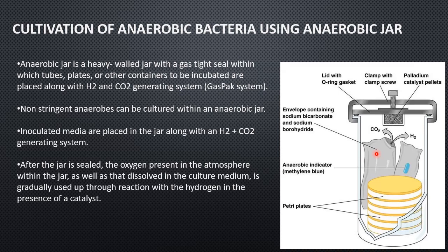When the reaction starts, the combination of the chemicals will start evolution of CO2 and H2. The H2 will now react with the palladium catalyst where the oxygen is present and it will start generating water. So again the same principle of palladium catalyst is applied here. Non-stringent anaerobes can be cultured within the anaerobic jar. Non-stringent anaerobes means non-obligate anaerobes, they can be cultured. So inoculate the media and place it in the jar along with the CO2 and H2 generating system.